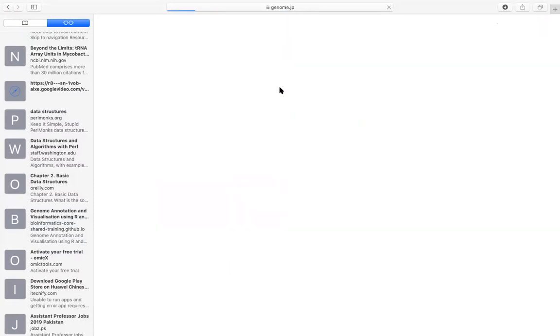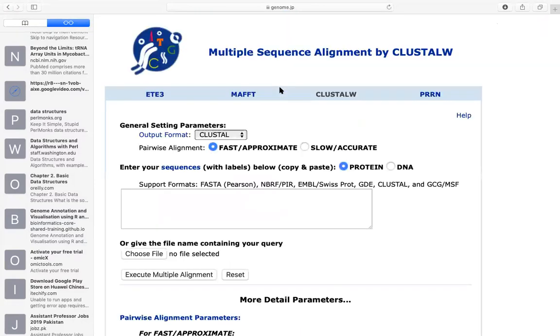If you click here, it will lead to the main page of ClustalW. This is the main page, or you can say it's the home page of ClustalW.